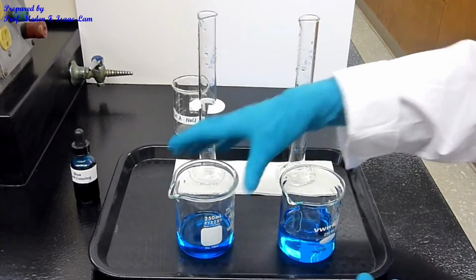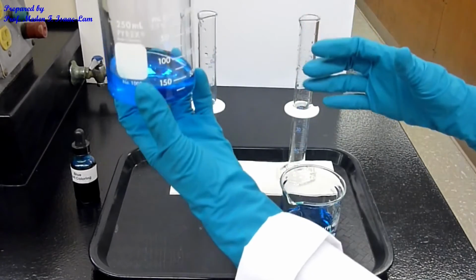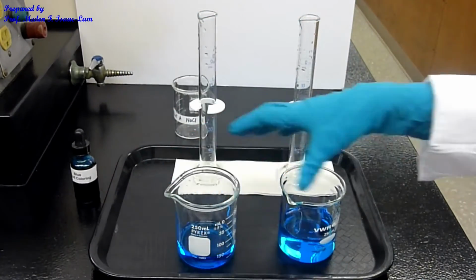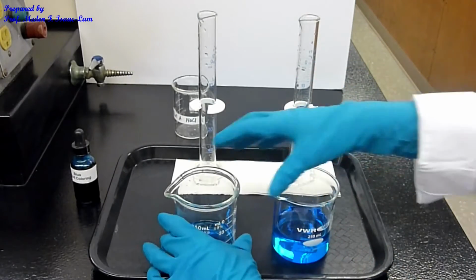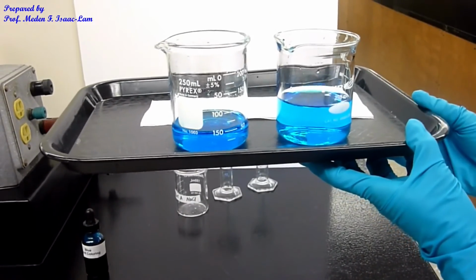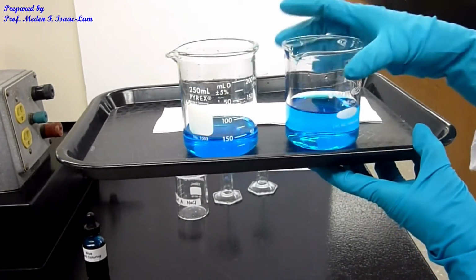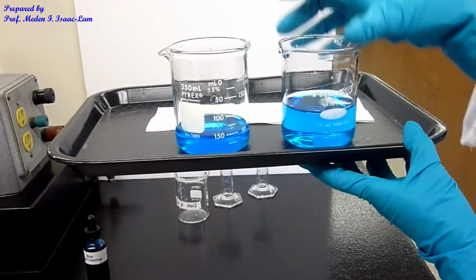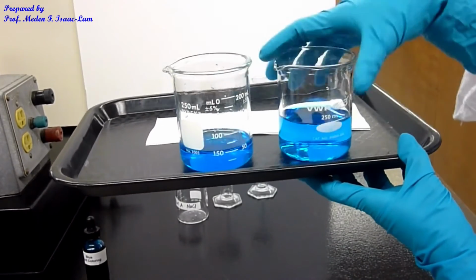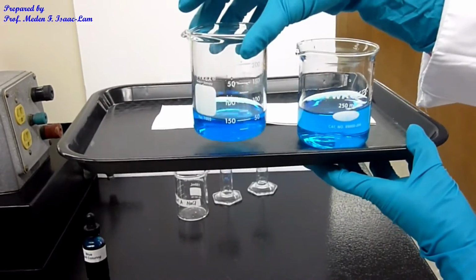Okay, so we're going to compare the intensity. This is the more concentrated one, and this is going to be the diluted one. The one on the left is the concentrated one. This one I added 50 ml more of the water, and you can see that the intensity of the blue coloration is in fact much more in here than the one on the right. So this is the diluted one, and this is the more concentrated one.